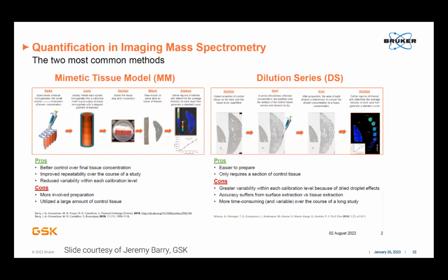So to end with today, and I know I didn't go too terribly long here, but I really wanted to try and tie together the things that you've heard today and show you the starting capabilities. And then it's really your imagination on how you can apply MALDI imaging and what's possible. But the last workflow that I wanted to talk through is quantitation, because this is something that's not talked about often enough in MALDI imaging, and it's something that is absolutely possible.